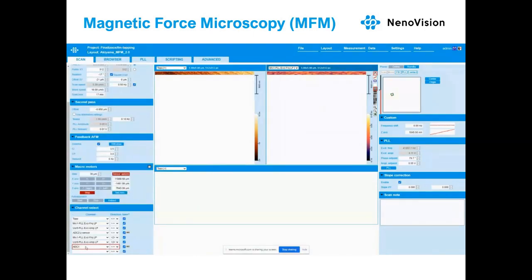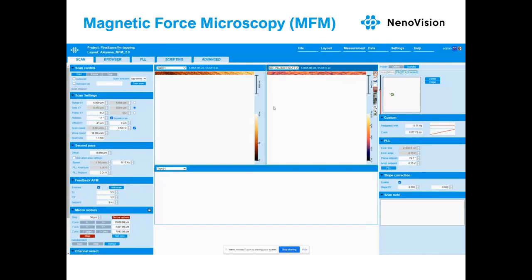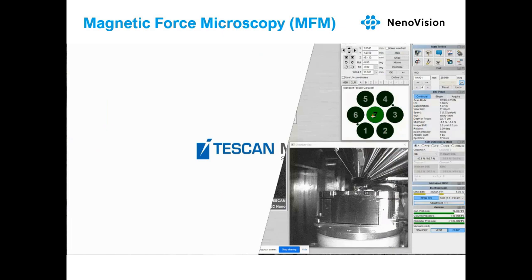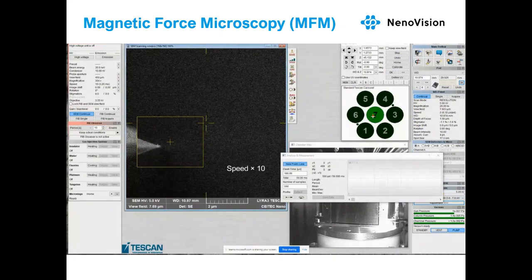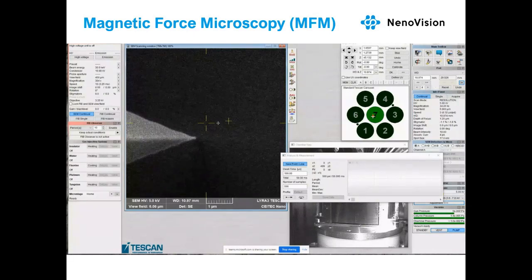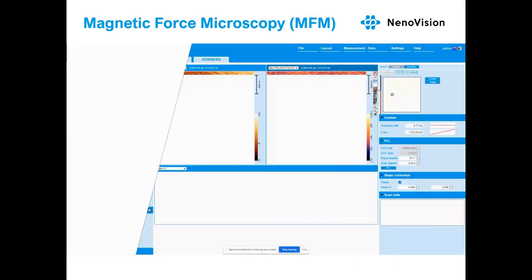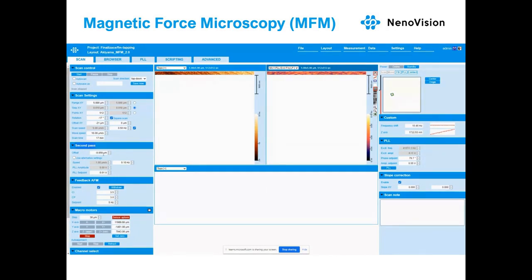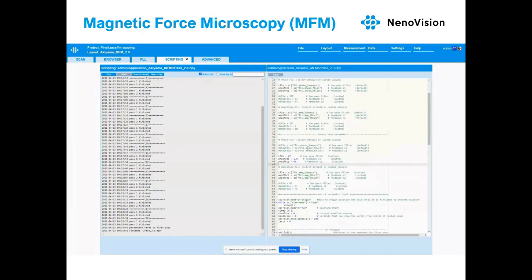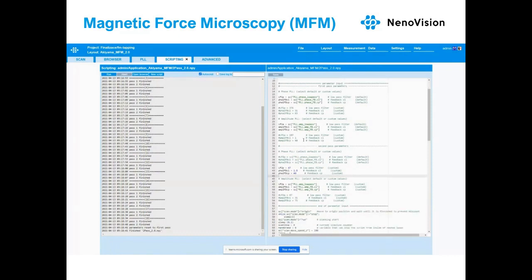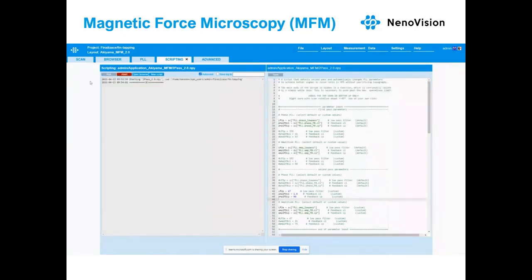After the approach, we select the appropriate channel which will receive the signal from the electron microscope. Switching to the SEM controller, we zoom onto the tip and select a point in its close vicinity. We use spectroscopy mode to collect signal from this point; the signal is then sent via a BNC cable to LightScope. Then you simply select the offset for the second pass, and as a bonus you can use a Python script to further optimize parameters during measurement — for example, to reduce noise.